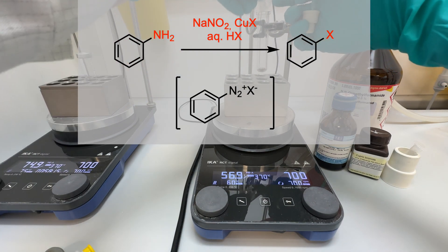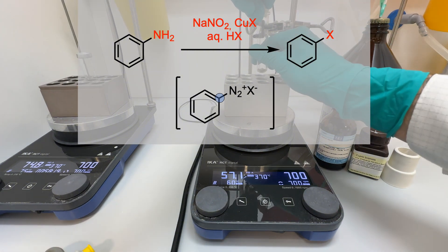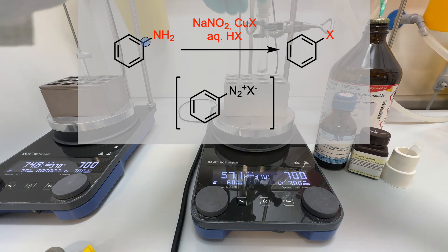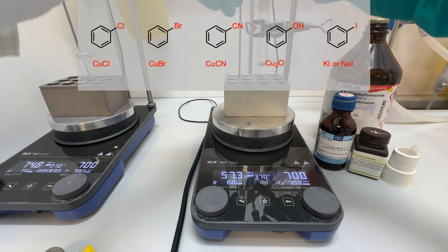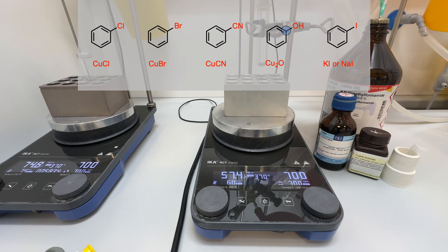Let's break it down. Aryldiazonium salts are usually prepared from the corresponding aryl amines via diazotization, a process that involves sodium nitrite under acidic conditions. The most commonly employed Sandmeyer reactions are used for chlorination, bromination, cyanation, and hydroxylation.